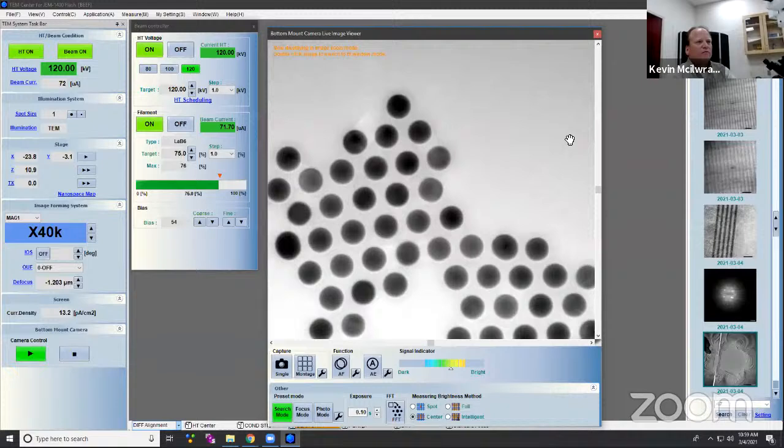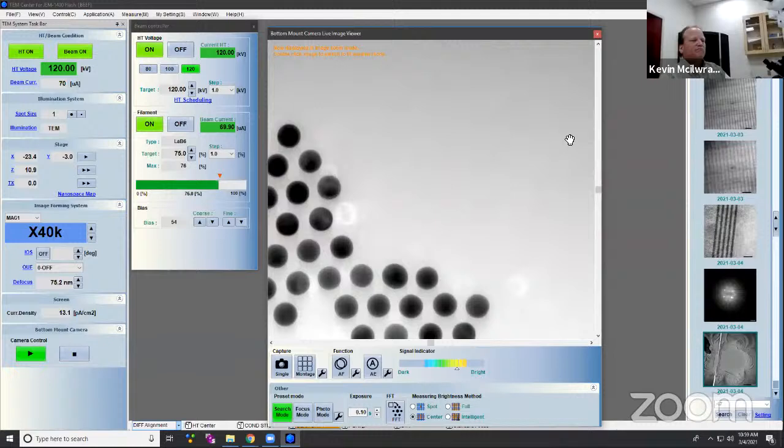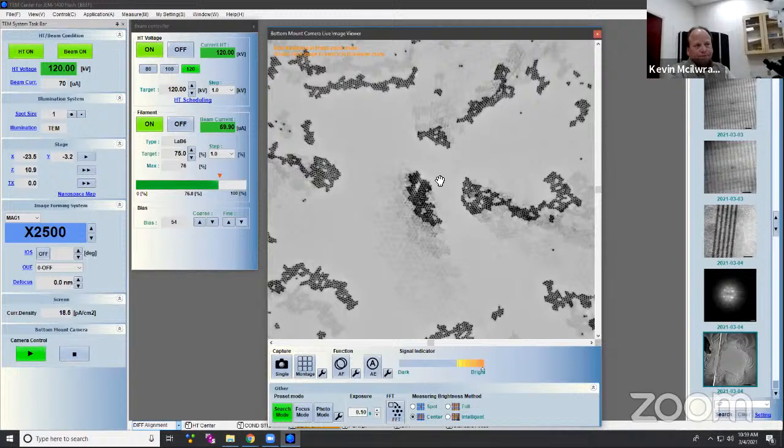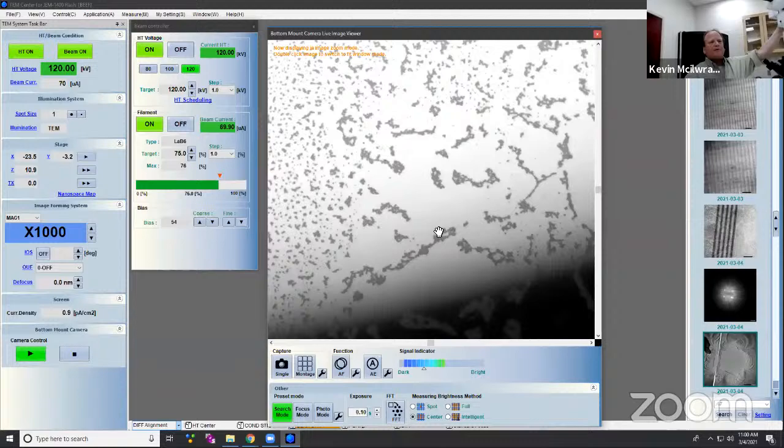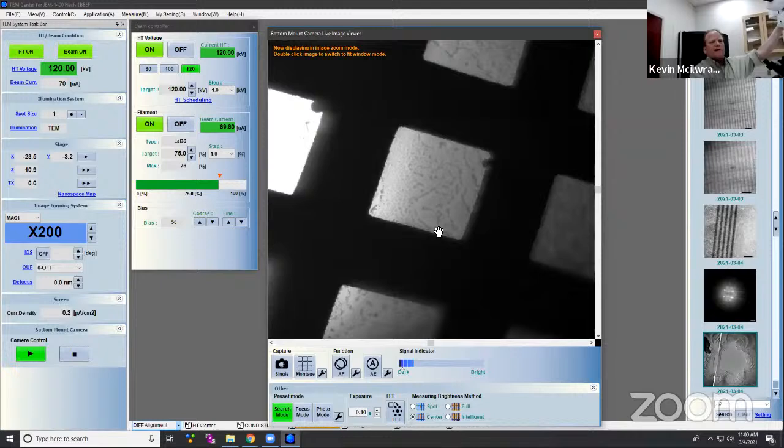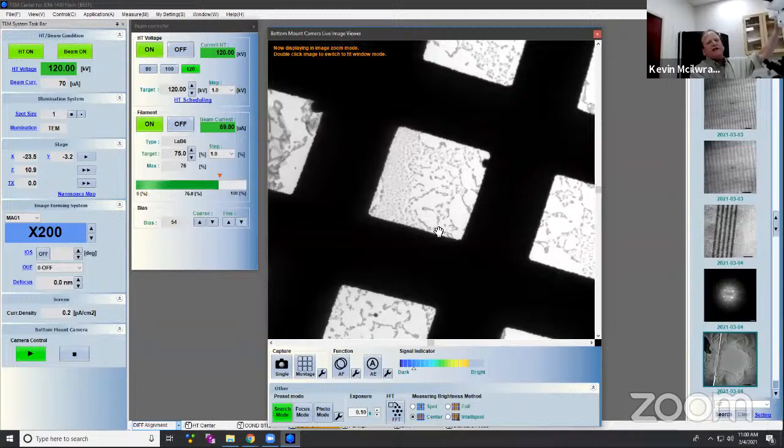Okay, so I've got my voltage center set pretty well. I've got my sample height set pretty well. My condenser aperture is aligned. So now I'm going to actually look at putting in an objective aperture. Now, for a lot of materials, we really don't need this. It's more for a lot of biological stuff, but I'll come here. And if I put in a pretty small aperture, I can see the aperture as I move it around, right?